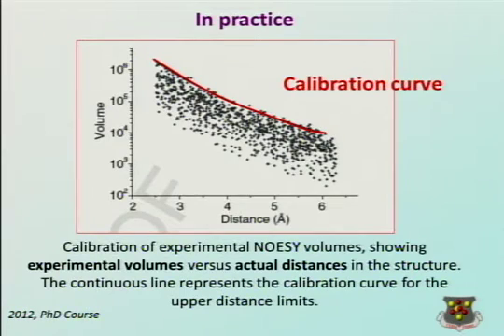So that's the idea. Whereas if you go above 4 as a distance, you are not getting any volume that is larger than this. And so if you would put your curve like here, then you are really getting much larger overestimates, and this is bad for your structure calculation. So you want the red curve to be as close as possible.